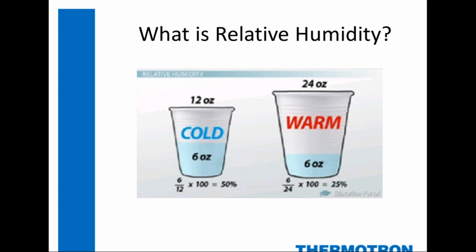Water purity is very critical with humidity chambers. You'll see in the manual, there are stickers all over the chamber saying that you have to have water that meets a certain purity level.